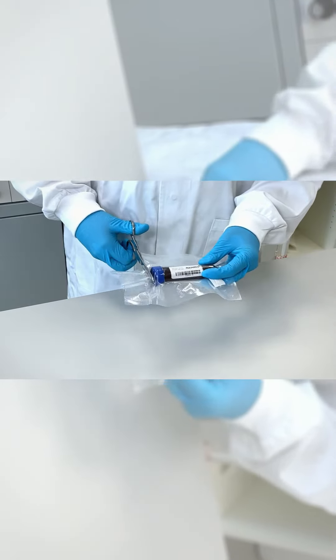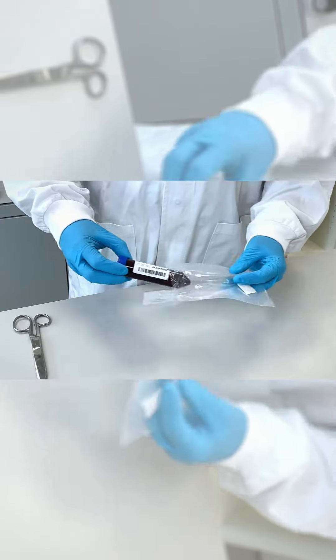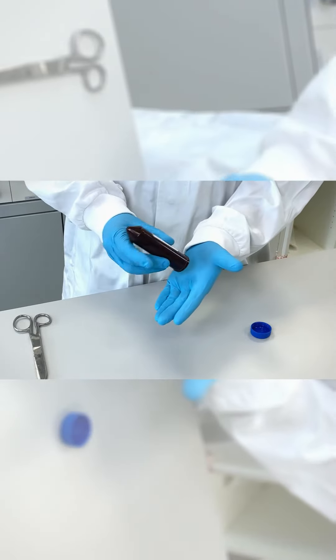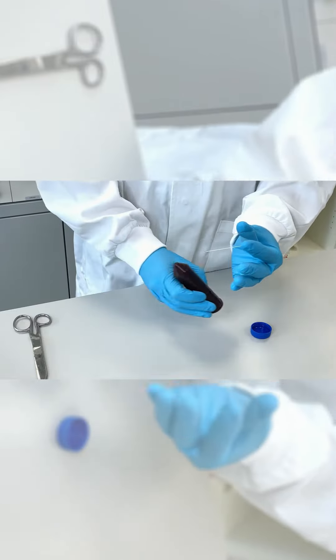Open the bag, get the tube out and carefully let the DMA slide into your hands.